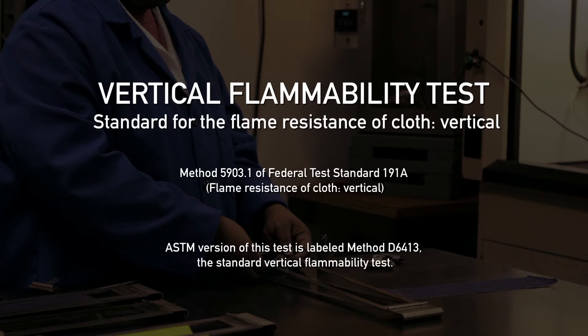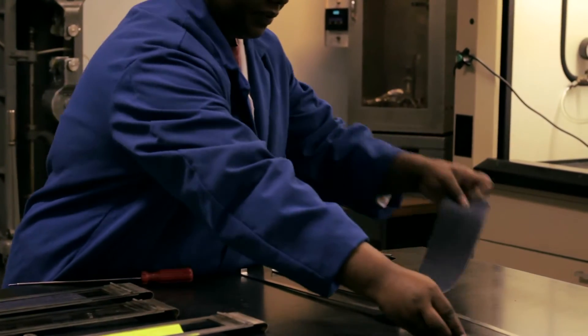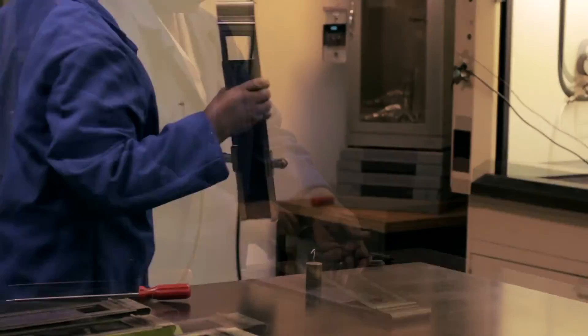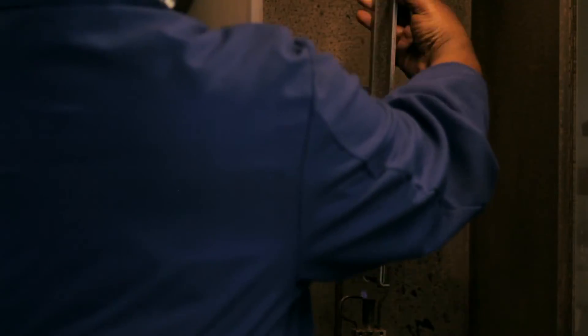The Vertical Flammability Test is the standard used to determine the flame resistance of fabrics in the United States. The test is conducted by applying a 12-second flame to the bottom cut edge of a 12-inch specimen. When the test specimen is removed from the chamber, three characteristics are measured.